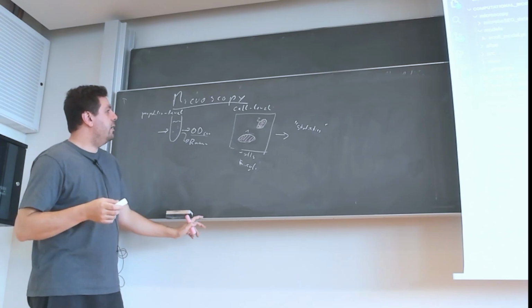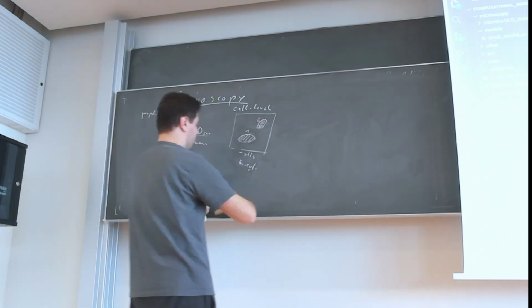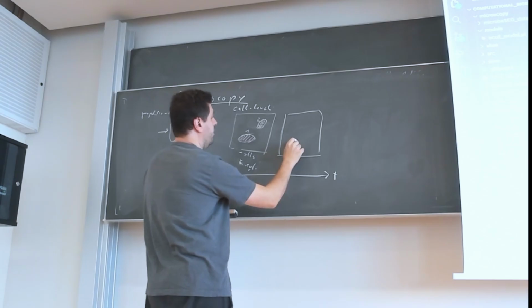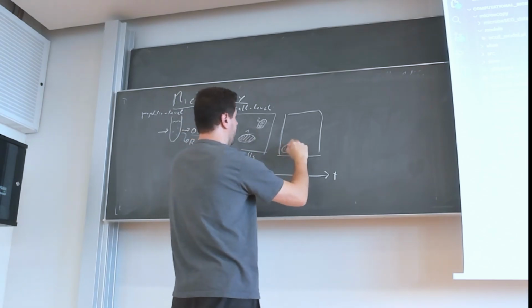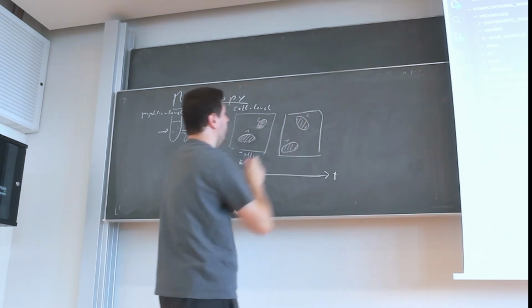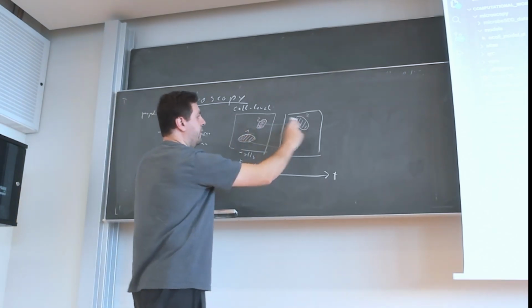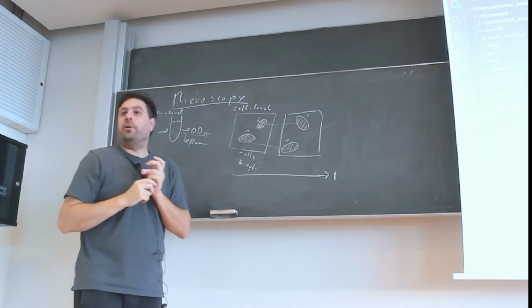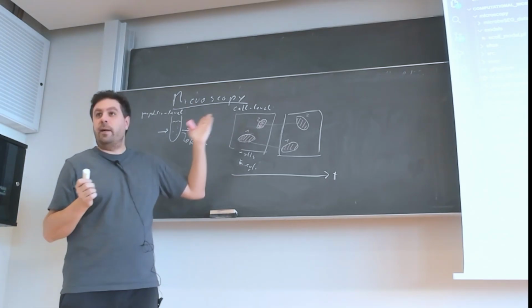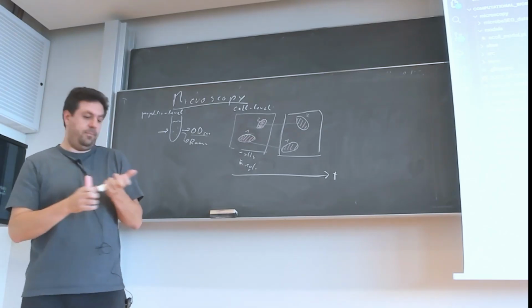There is an even more advanced problem, but we are not going to cover it in this lecture. This is tracking. You have the next image, from a timeline T, and let's say you have the same cell, which would again be 1, and this has now moved here, and this is again 2. So you follow the trajectory of the individual cells, and you know that this cell belongs to this cell and this one belongs to this one, and not vice versa. Of course, with cells it's a bit complicated because they can go out of view, they can disappear, new cells can come into view, they can duplicate, or they can die and dissolve. So you have to be very careful with this.